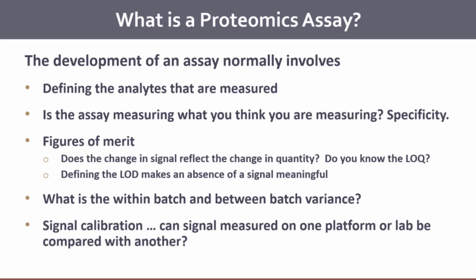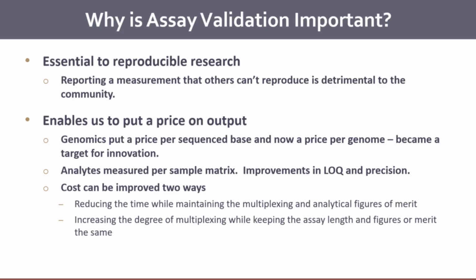And then there's signal calibration, which is: can I take data that was collected in one lab and compare those signal measurements to data collected in another lab? Can I take data that was measured on a TripleTOF and compare those intensities to data on a Q Exactive? That's the goal of signal calibration, and I'll talk a little bit about ways in which we think about this as well.